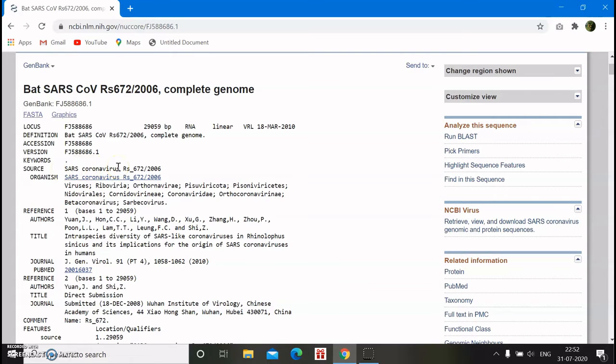The next field is accession. It's a unique identifier for a sequence record. An accession number applies to the complete record and is usually a combination of letters and numbers. Next comes the version, a nucleotide sequence identification number that represents a single specific sequence in Genbank database. Even if there is a single nucleotide change in the submitted data, the version number will be increased.